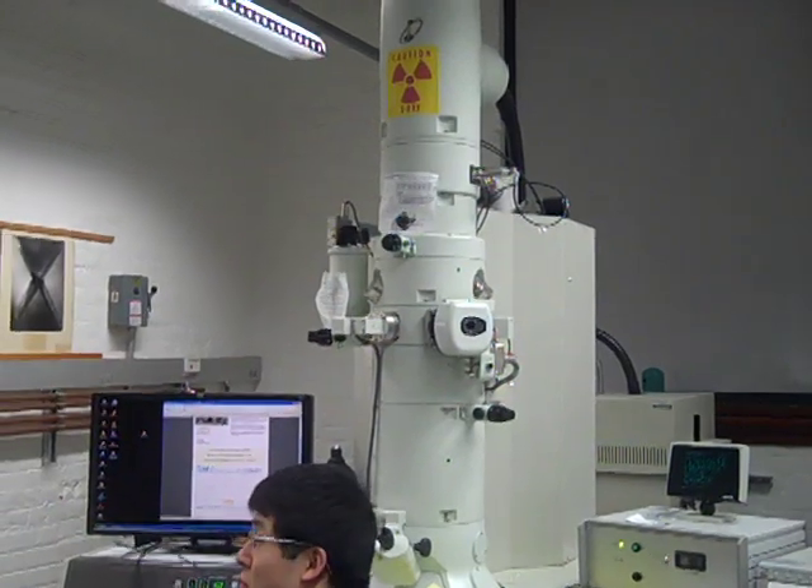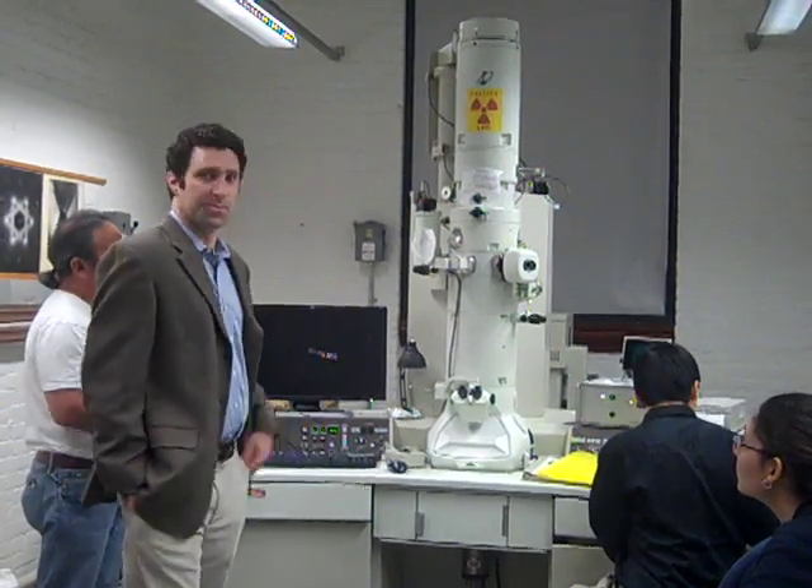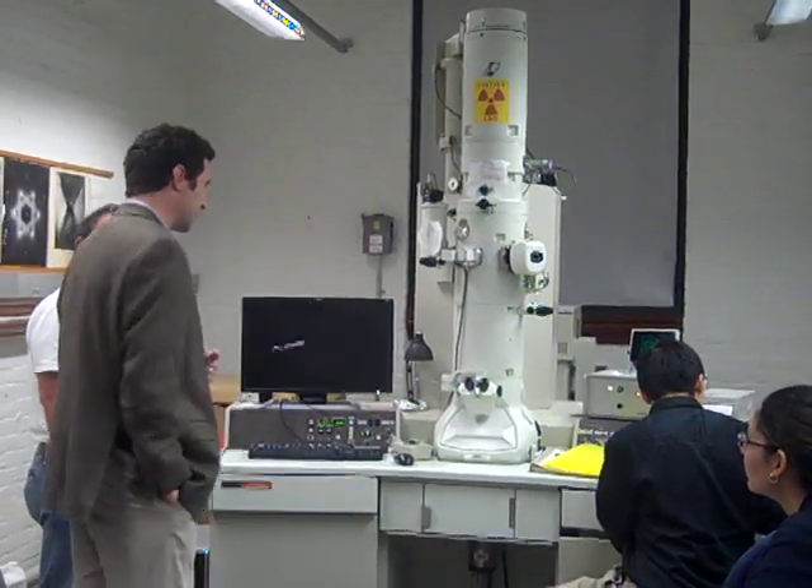We are really at the forefront facility in the world for electron microscopy. We have ten electron microscopes. For those who don't know, electron microscopes are bigger than your tabletop microscopes, and they require a lot of money to purchase and to keep them going, as well as a lot of expertise. That's what's in-house at NSAP. We have technical staff that run the microscopes and can help users operate them if needed.